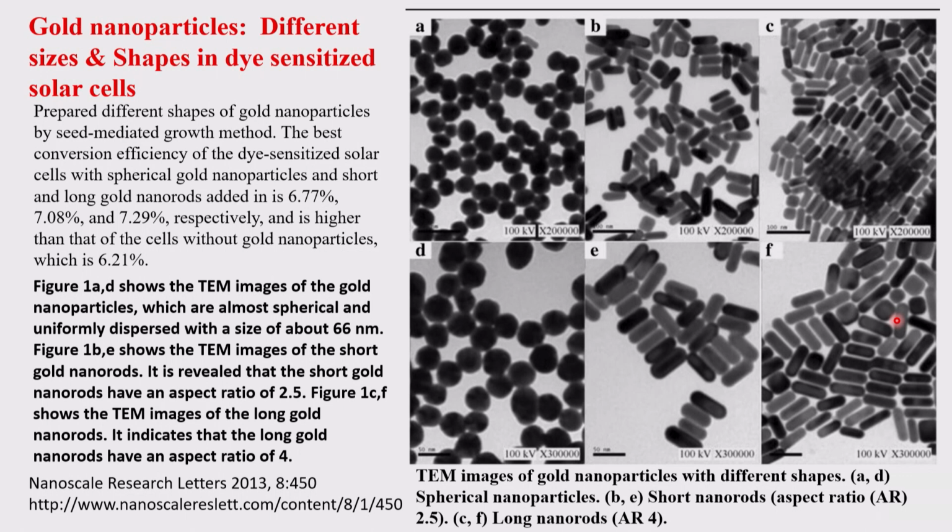Okay, so that is a great challenge, and researchers have achieved a very high percentage of purity already, which is reasonably good enough for the application purpose to attribute whatever the property that you're finding to that particular shape, to that particular size, to that particular surface area, to that particular porosity, depending upon what kind of things. In this case, we don't talk so much about the porosity because these are the nanorods and nanospheres which are made up of the metal, which is gold.